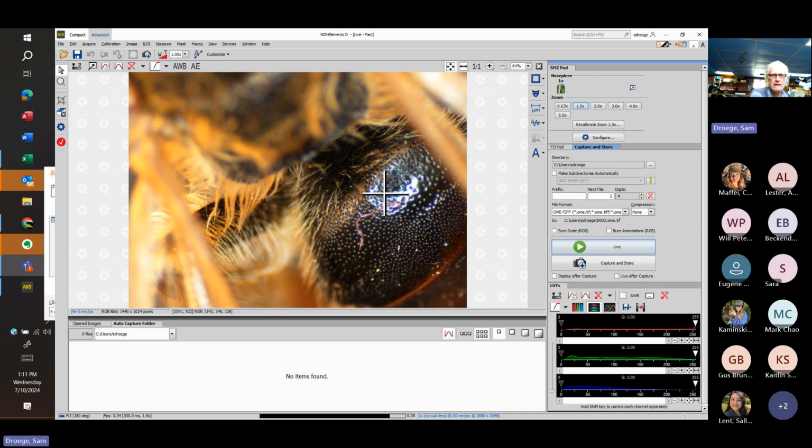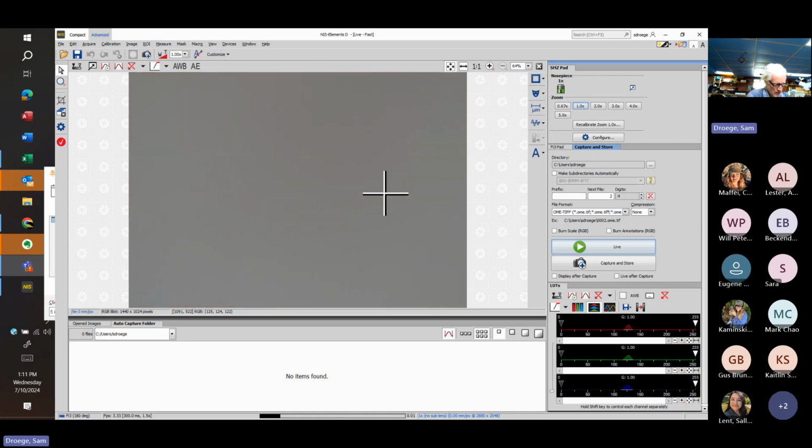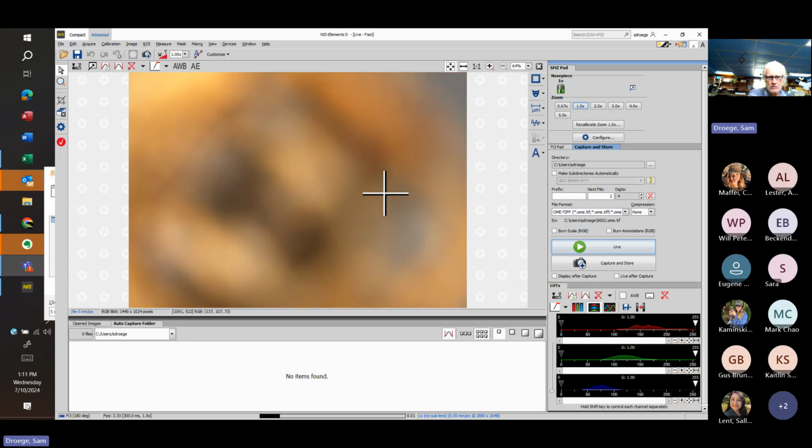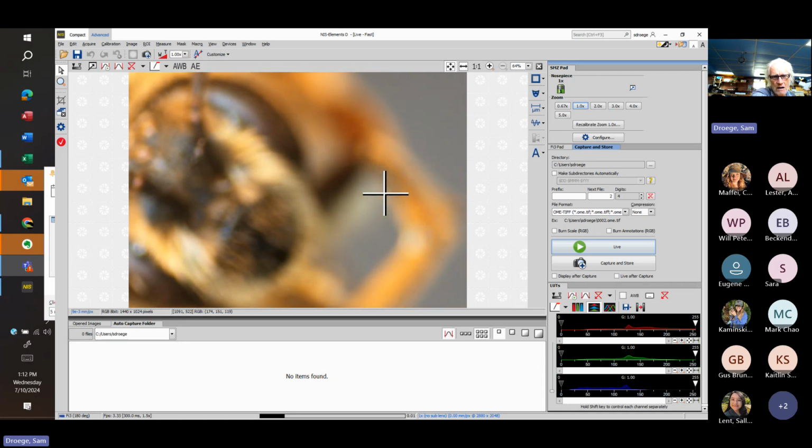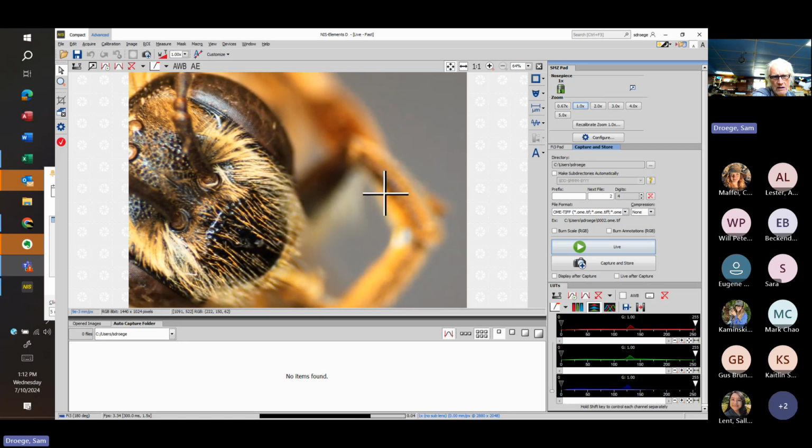We also were looking at fovea characteristics as being part of the identification stream. I moved it pretty quickly, but unlike some of the species, it has big white patches of hair, very dense, very white, and very noticeable on the sides of the abdominal tergites. Again, that's often not used in a definitive way because it is sometimes difficult to see.